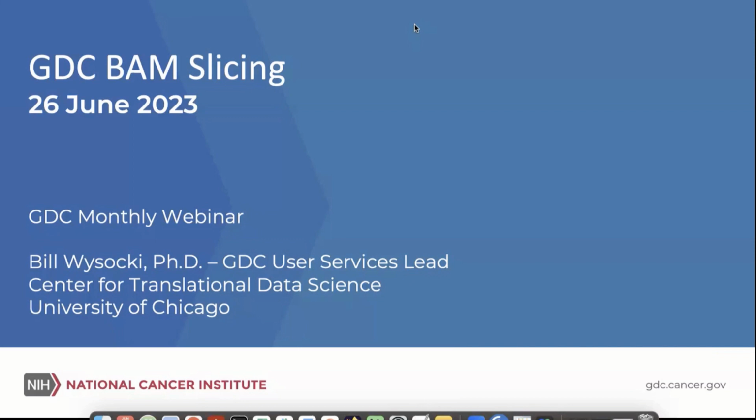I'm the lead for the GDC User Services team, and today I would like to talk to you about GDC BAM slicing.